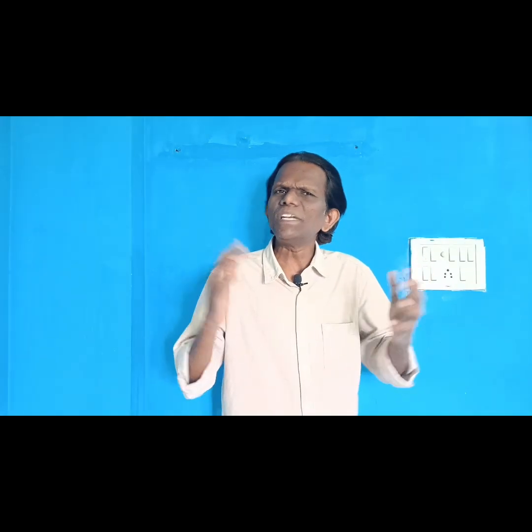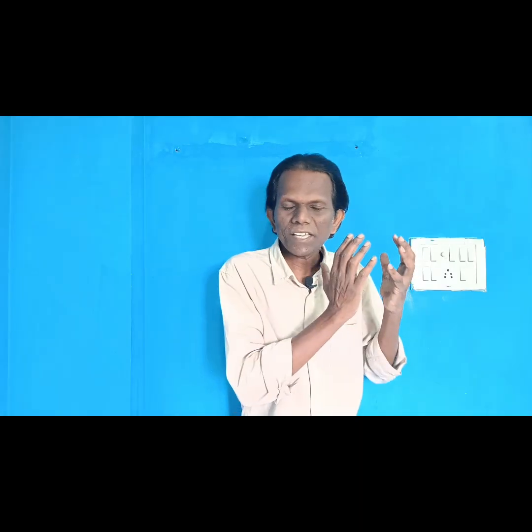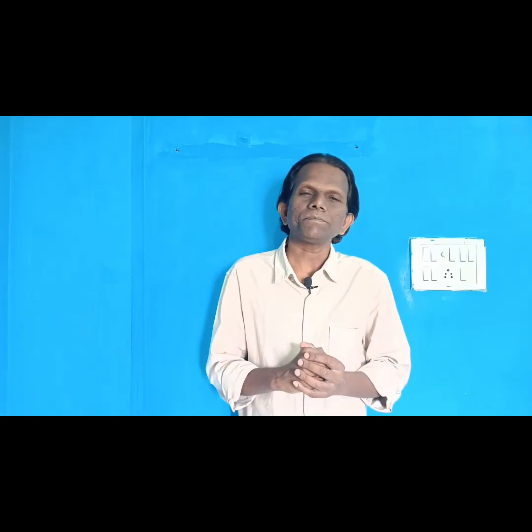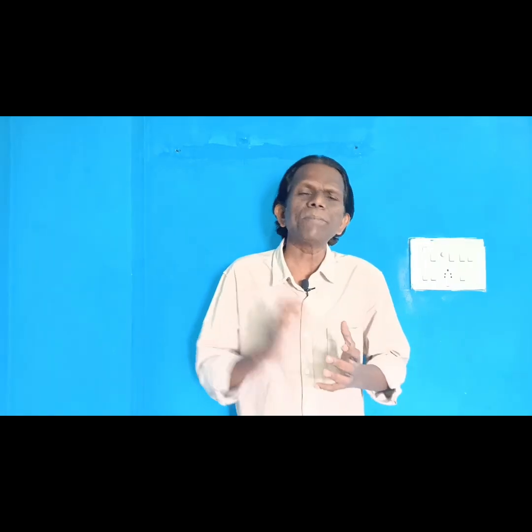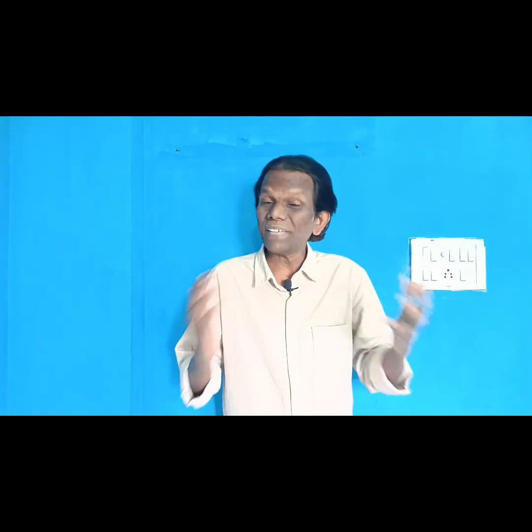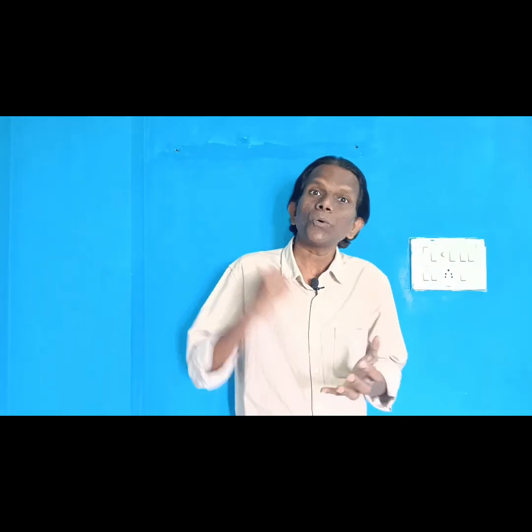Now we will discuss aerobic plate count or total plate count in the USFDA BAM method, Chapter 3, and ISO method 4833-1. Just a comparative study. In both the methods the media is the same, plate count agar, but the time and temperature may vary. Why?